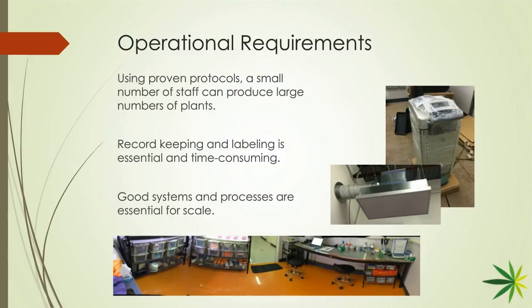Yeah, and I can tell you for some of the projects that we have been speccing this into the business model, it starts out with traditional cloning. You've got to do that to get going, and we are looking to scale into this, and it's over a 9 month to a year time to really replace our traditional propagation from cloning into this methodology. And so just think about that as our audience is looking to possibly do this, that it will take some time, but when you finally make that switch, you'll really see the impact.